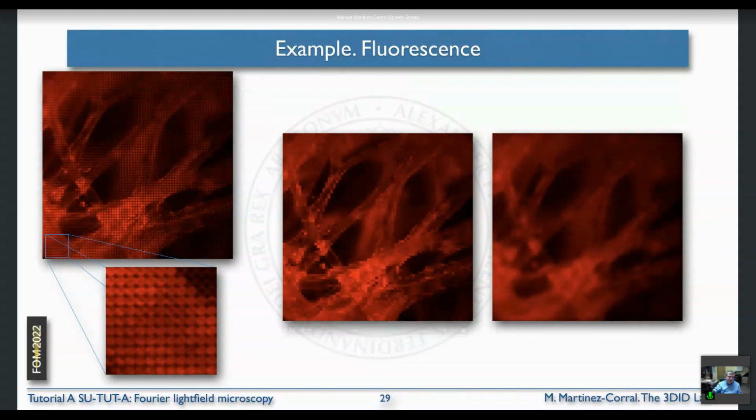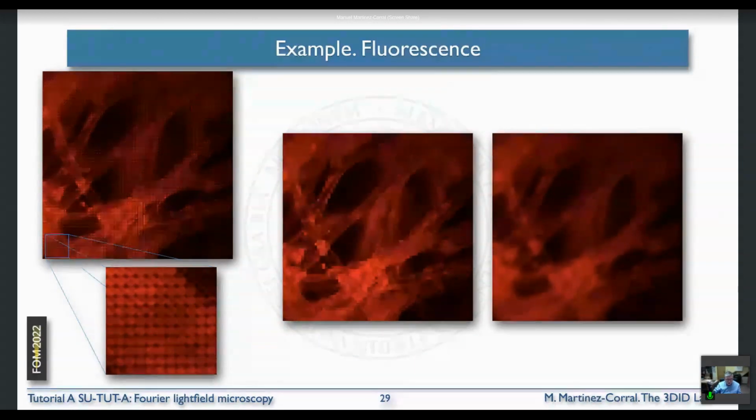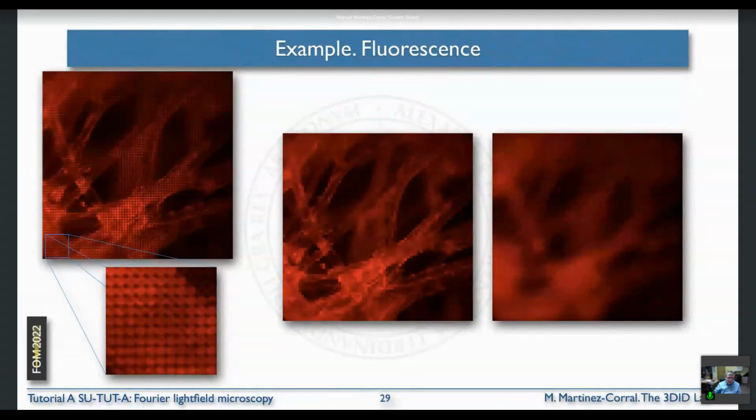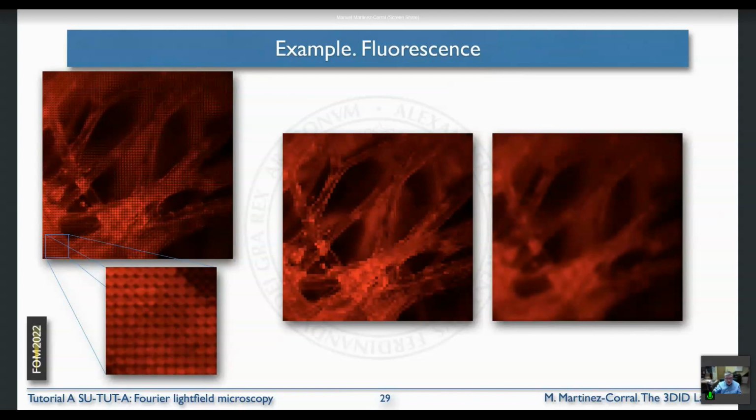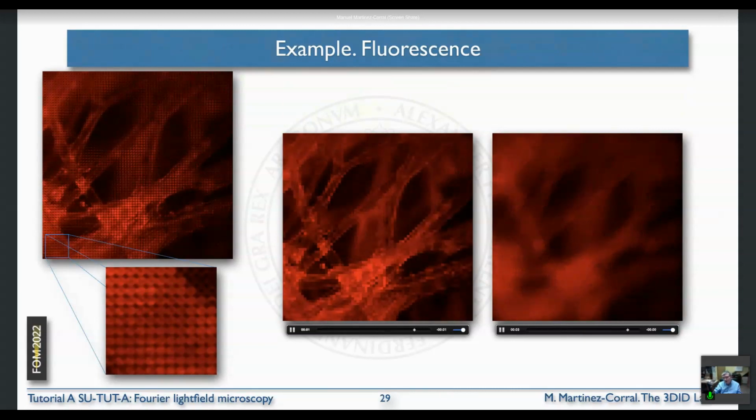These are cotton fibers. These are the micro images captured directly with the Lightfield microscope. You can see these are the micro images. Micro images are not circular pixels because there is angular information within any of the micro images. From this information, we can obtain perspective views and also depth reconstruction.